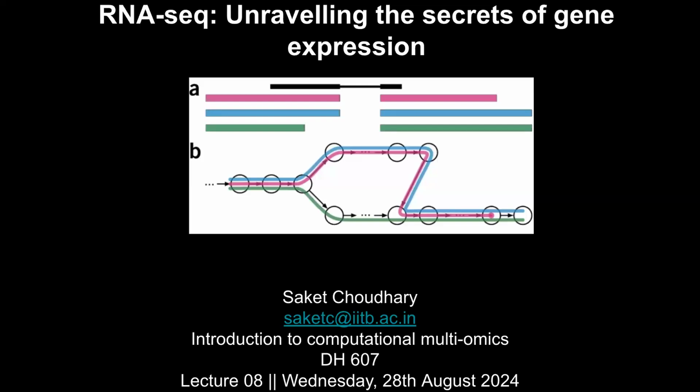quantify the data? What comes out of it? How do you think about analyzing it? So we'll do the RNA-seq quantification today. On Friday, we'll do how do you analyze or do an exploratory data analysis with this kind of data.